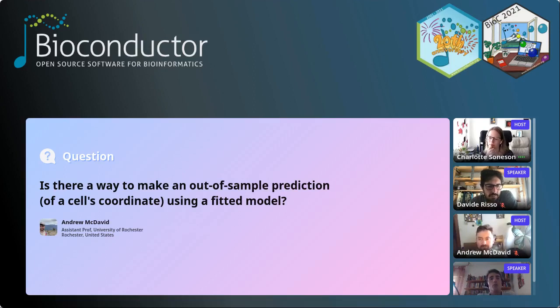So if you use the fitted model, you can pick up the alpha matrix and use that to transform your data into the low dimensional representation. You can do the same with the parameters of the batch effect or some other gene-related variables.